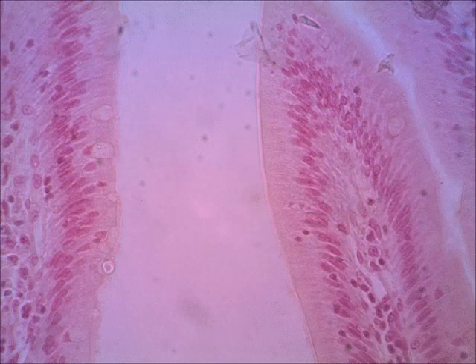On this next slide, all right, here you see it on high power, and you actually can see the columnar epithelium. See all of this is columnar? And I want you to notice on the surface of it, see how it looks real hazy? It almost looks like somebody took a magic marker on the surface. There you see on the other side of this other villus. This represents microvilli, not cilia, like you would see in the respiratory tract, but microvilli.